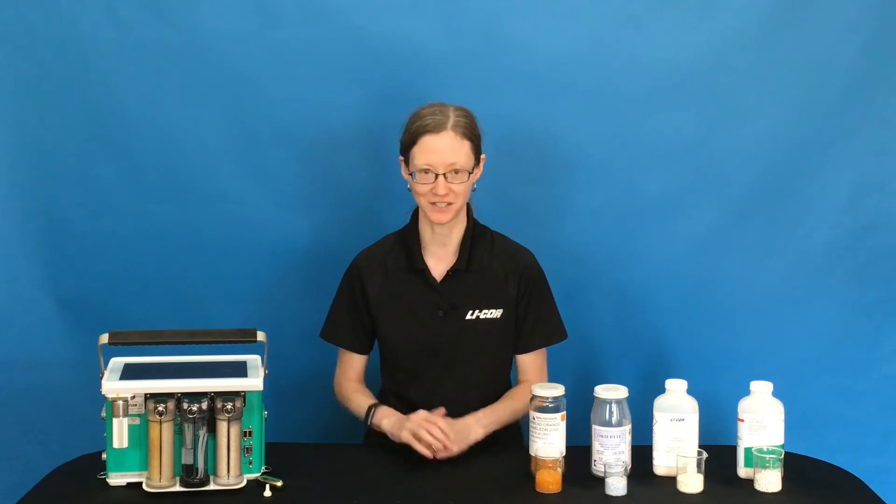Hi, my name is Elizabeth Gordon, and I'm a Senior Technical Support Scientist here at LI-COR. I wanted to give you a brief overview of some of the options and features of the chemical columns on the back of your LI-6800.